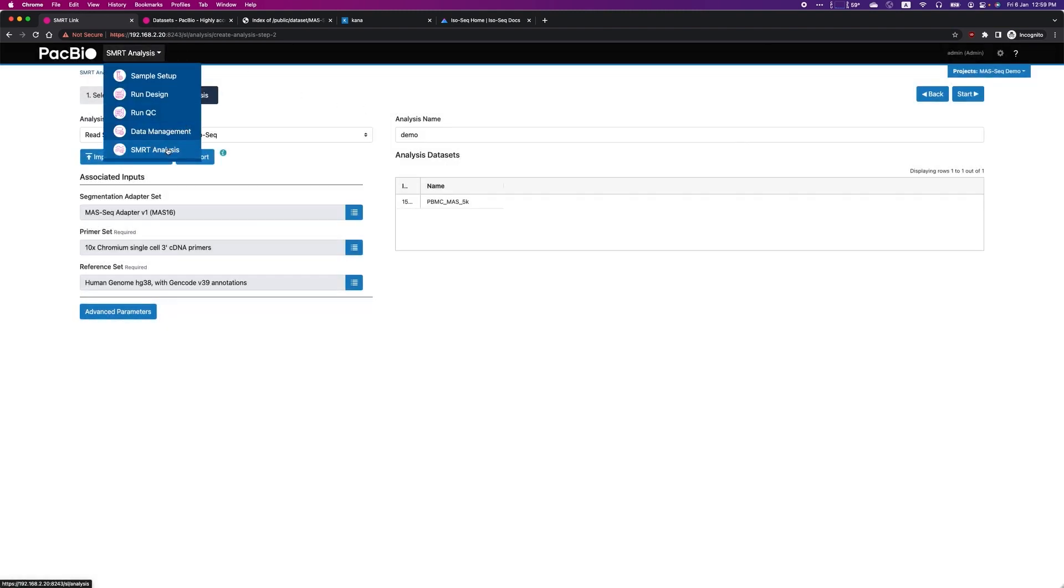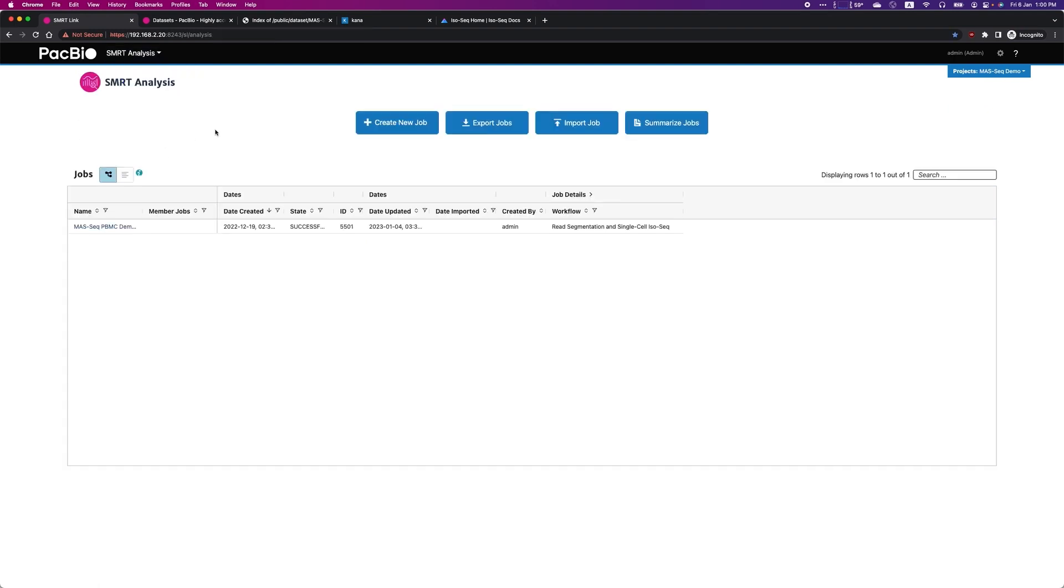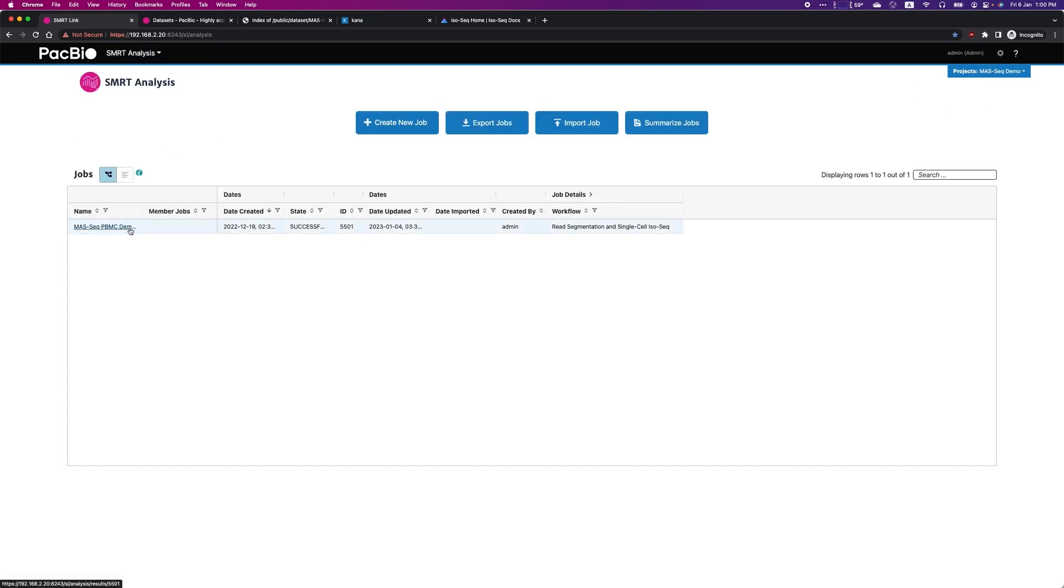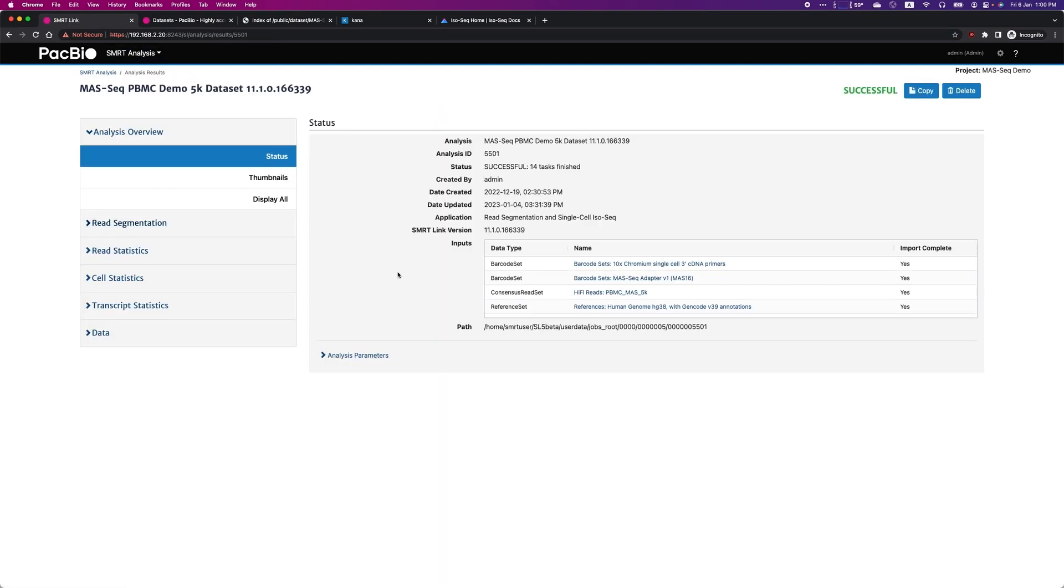After the analysis, you can view the results interactively in SmartLink. Here is the result for the 5,000 PBMC cells dataset.